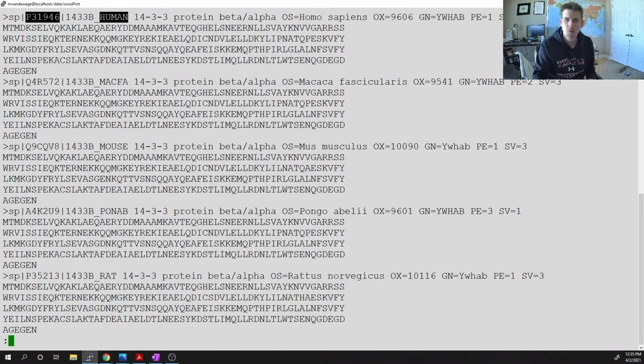Anyways, SwissProt, really, really awesome. And so, right, we're not worried about all the annotations just yet. We want to find out what our proteins are derived from. Right, so this is just my go-to database for annotating vertebrate genes. Because most likely, if it's closely related to a human, or if it's certainly a mammal, we're going to have pretty good information on it.